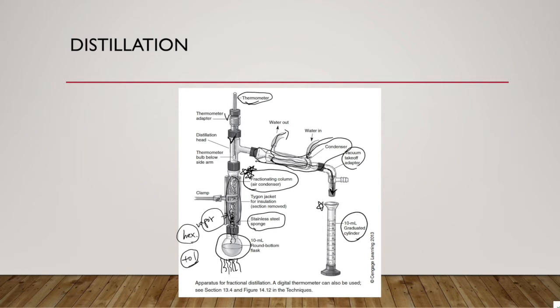So in the meantime, in this fractionating column, these vapors will undergo multiple cycles of evaporation and condensation. So if you look carefully during the lab, if you're in person, if you're taking hybrid lab, then you will see a vapor ring forms at the beginning, but then it will slowly go up.